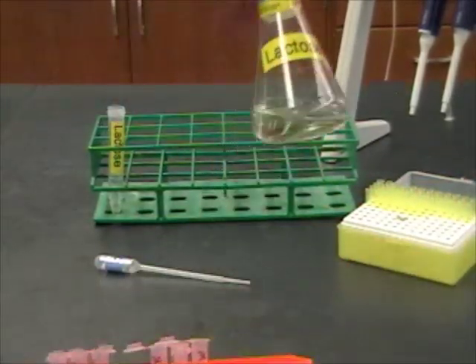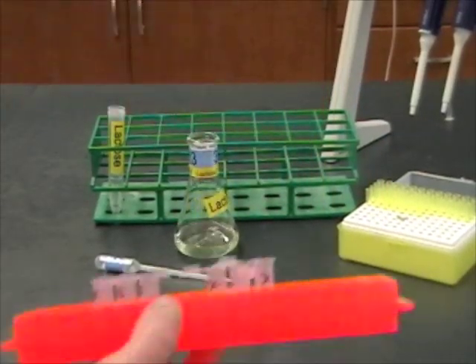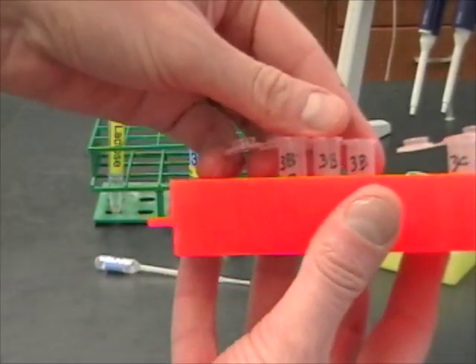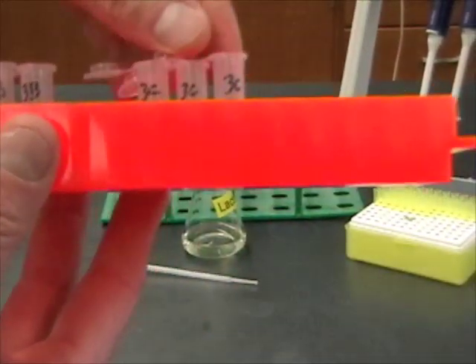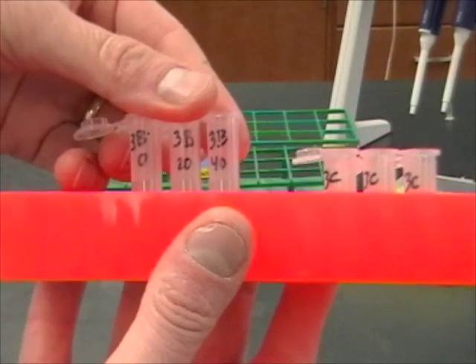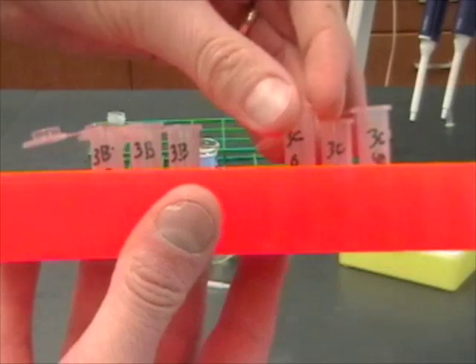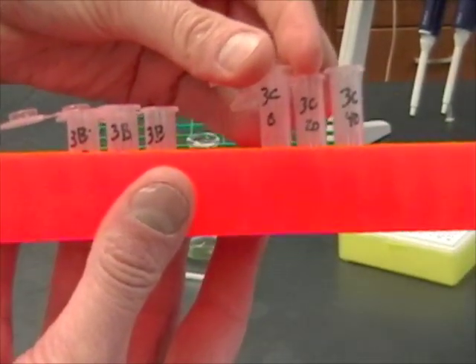Remember that I have flask number 3 here, and so I have labeled all of my tubes either 3B or 3C. I've also added on the tubes the time. We're going to do a zero, a 20, and a 40-minute time point. And then for the C tubes, same thing: zero, 20, and 40.